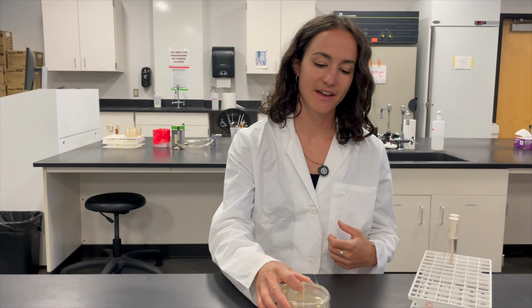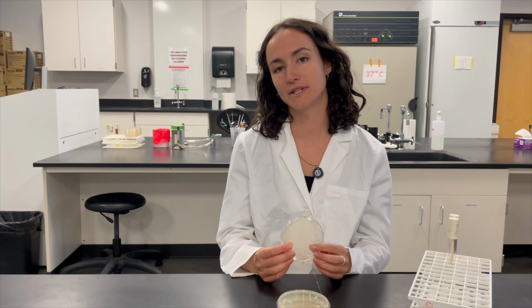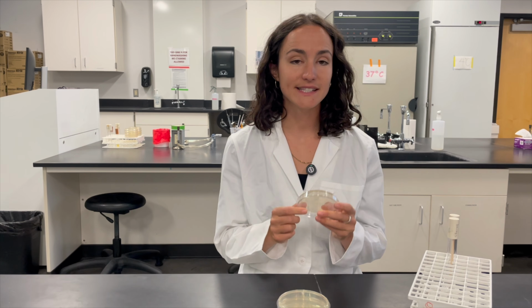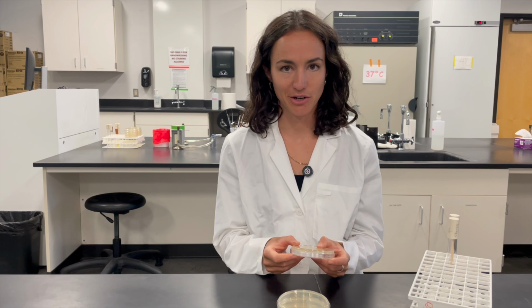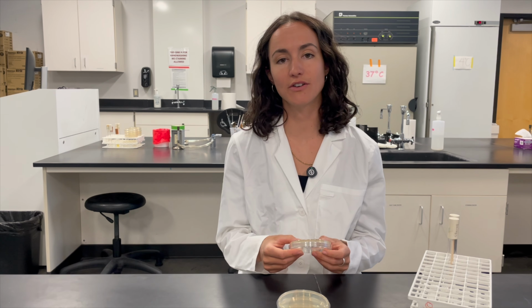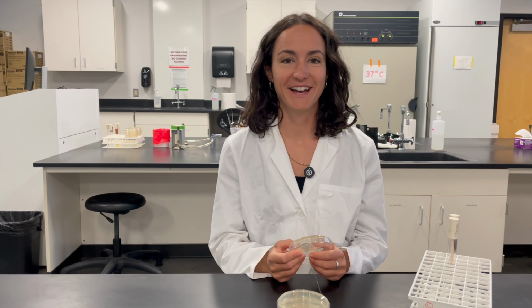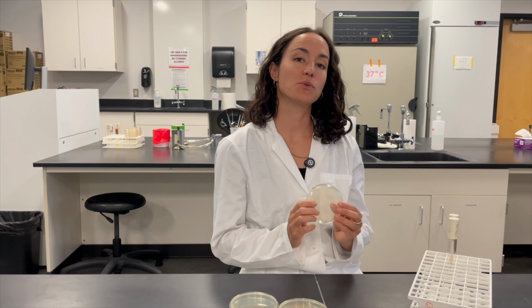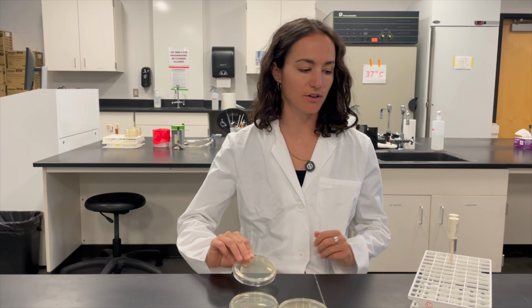All right, so we've got some petri dishes, and we're going to culture microbes. Culturing microbes basically means intentionally grow them. Inside of the petri dish, we have culture media, which is essentially microbe food. It has nutrients that are going to target the microbes you want to grow, and it also has agar, which is a solidifying agent. In this case, it's extracted from seaweed. We're going to use tryptic soy agar, TSA. This is a standard culture media. Lots of microbes are happy growing on here.